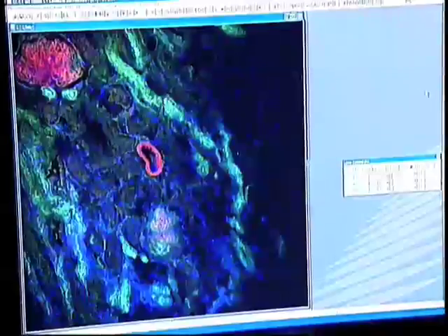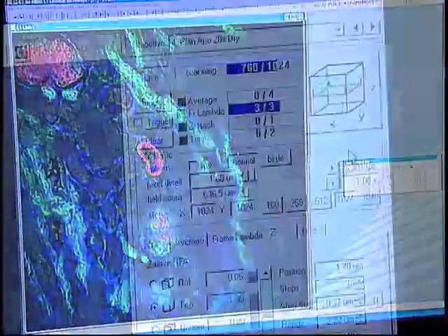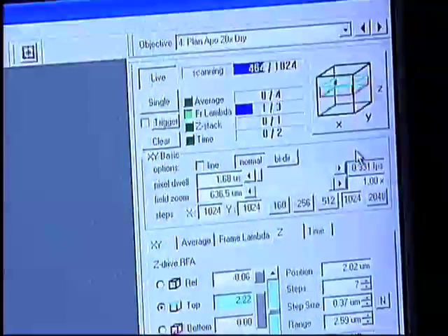We can then set up so that we can do the full volume here, then adjust the bottom and top settings here. So now we can set it up to do a full Z stack through our sample, and what you'll see here is the individual planes as they get acquired. So it's doing blue, then green, then red, and then it's moving Z, and then repeating that process.